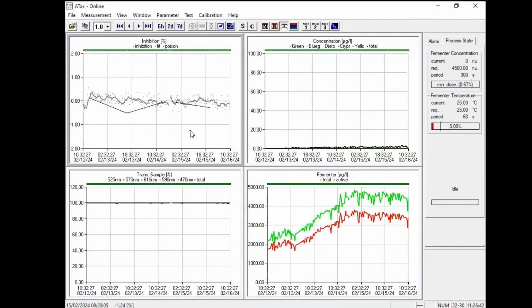Normally during a measuring cycle of 30 minutes in the loop, every type of water we measure is stored for 20 minutes. And during this 20 minutes, there's sedimentation, but also the algae will try to settle down, and at the end they may glue to the surfaces of the loops.